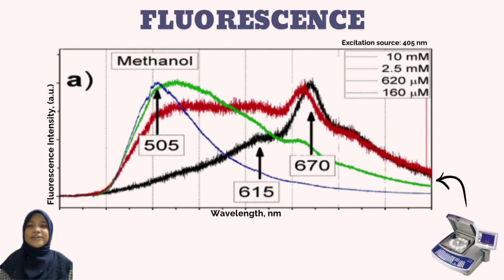Quercetin has a highly conjugated pi electron system and several hydroxyl groups, allowing it to absorb light and produce fluorescence emission. The main objective of this analysis is to determine the fluorescence emission peaks of quercetin and to study how different concentrations influence its fluorescence behavior.